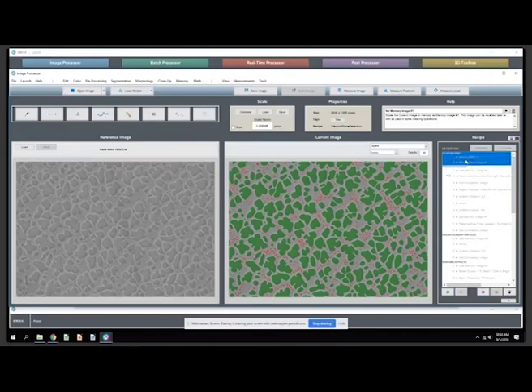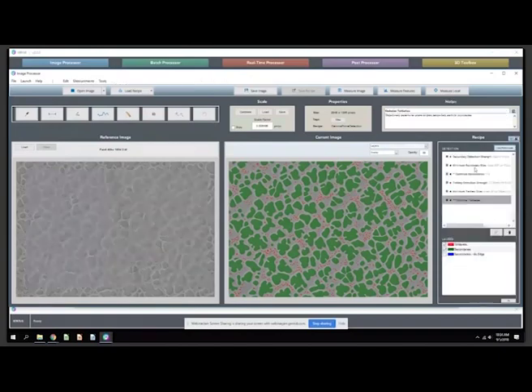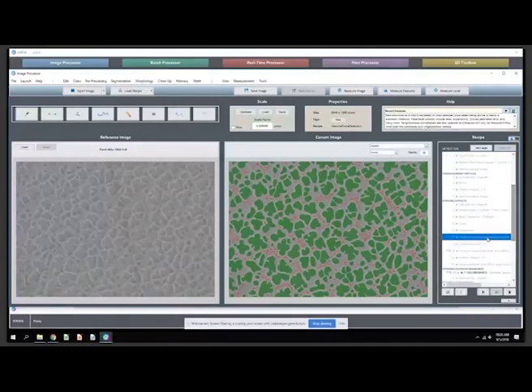So this is our noise reduction step. In here is some of the steps where we go about finding the background and normalizing some gradients. Then we go in here and we look for the secondary particles. Then we go down here and we try to remove some falsely identified particles and fill in unwanted holes. And you see these flag steps here. You simply click on a step and hit flag, and now it becomes part of what you see in simple mode. All steps also have notes available, which I should have mentioned earlier.